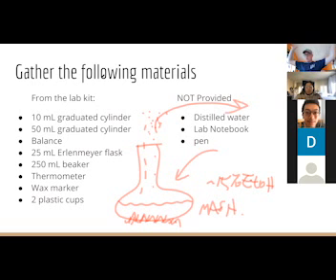So I just don't let them go out in the air. I capture them, I transfer to another container. And what do I do in the second container? You condense it? Exactly. How do I do that? By lowering the temperature.